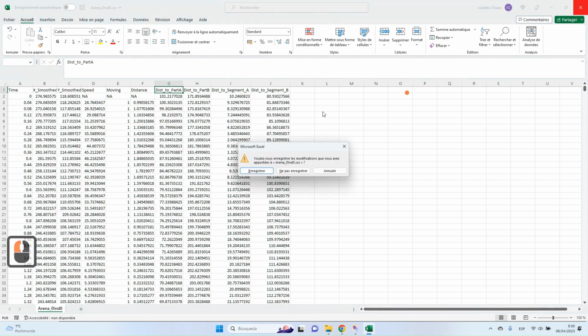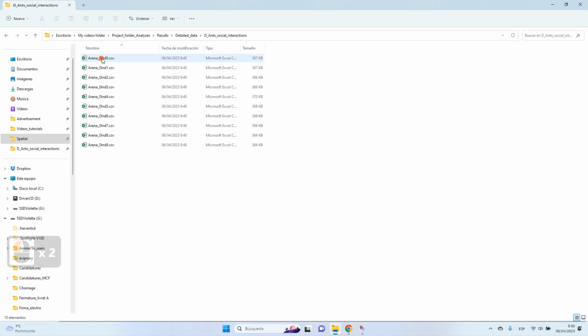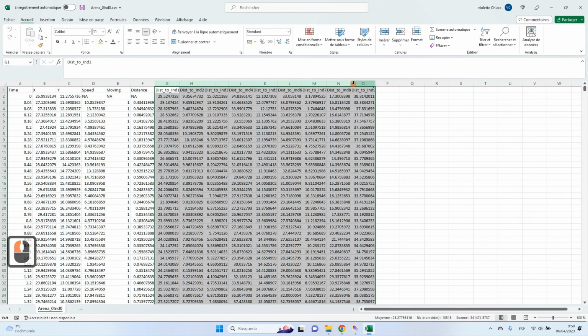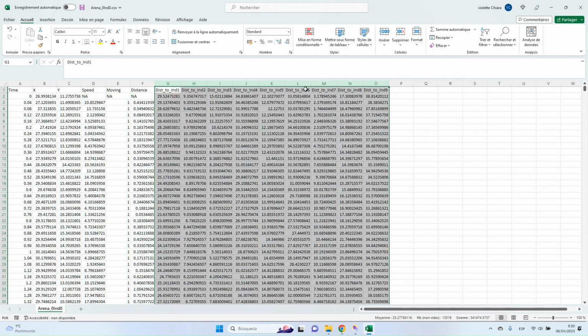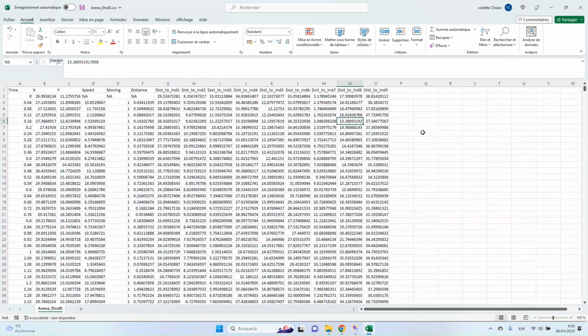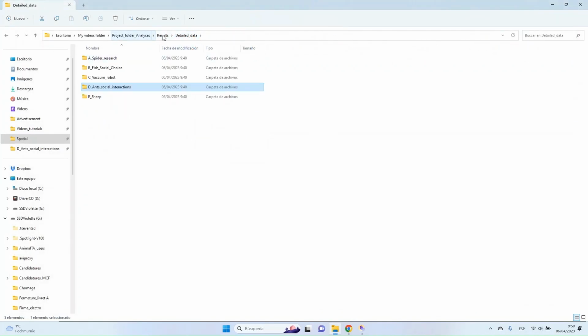But you might also find information about the other individuals. For instance, if I take the ants' information, in this case, it will give me the distance to each of the other conspecifics. This table is not really analyzed; it's just there if you want to make personalized analyses, something a bit more complex, so you have all this data kept here. And I think we went through every kind of result data you may have with the program.